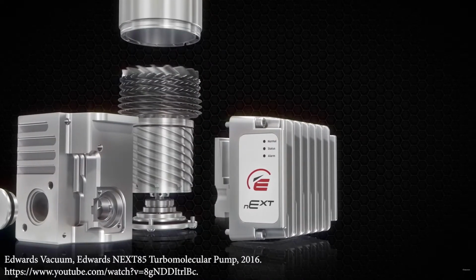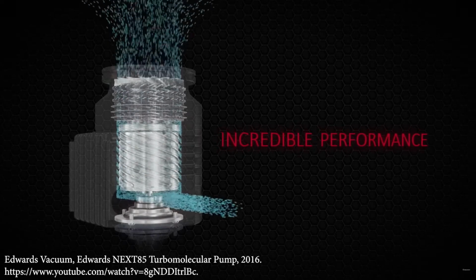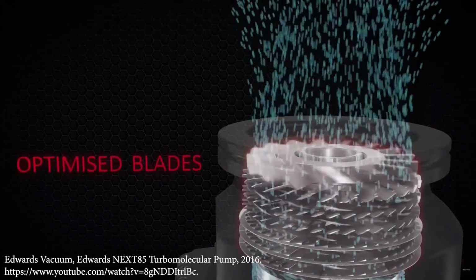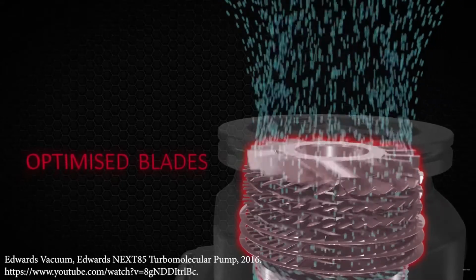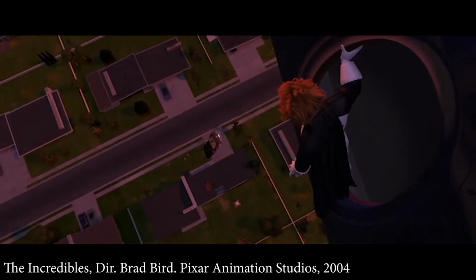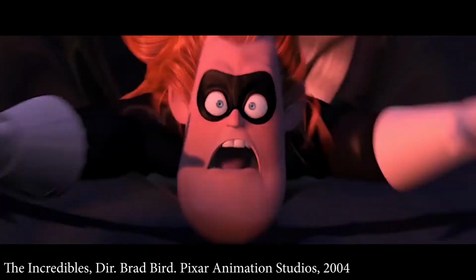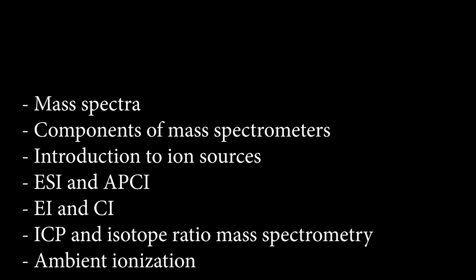So the turbomolecular pump really is a lot like a jet engine. Instead of blowing out, we're pointing the end that sucks in at the chamber, and then it's blowing that gas out in the room. It spins incredibly fast. It actually can't operate at atmospheric pressure. If you fire these up at atmospheric pressure, they heat up and they get destroyed, and they're very, very expensive. So you have to have another pump to back them up. And these really are just like taking a jet engine and pointing the part that sucks in at the chamber. And this reminds me of the cliche in action movies where, oops, the bad guy gets sucked into the jet engine. No kicks! So we looked over the basics of mass spectra.